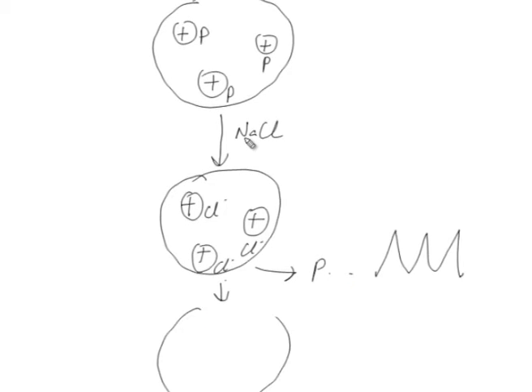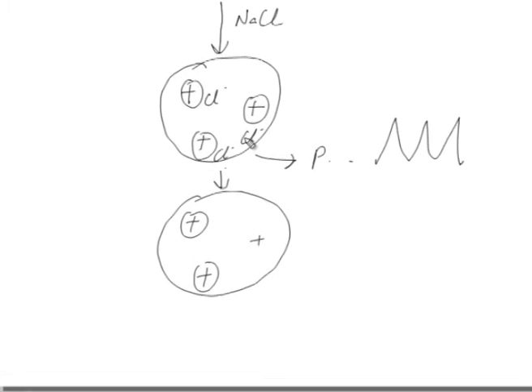So, again the simple buffer will be put in, and extra Cl or extra eluent will be washed off, and you will regenerate the column, which will be as the starting position, and so this resin could then be reused for another purification. So, this was in very simple way I tried to explain the mechanism of the ion exchange chromatography.